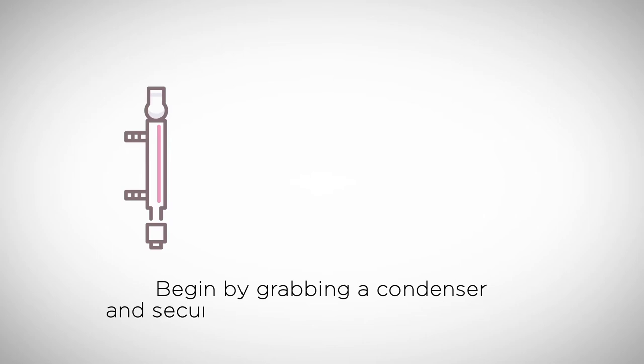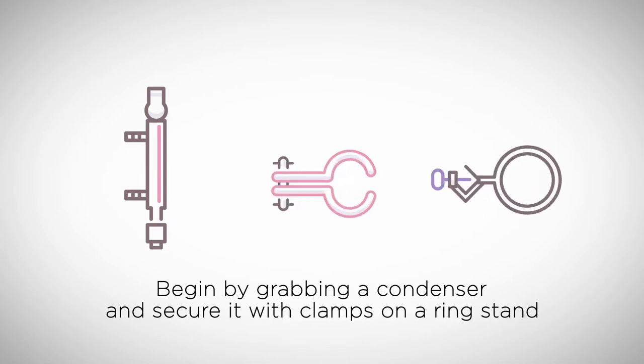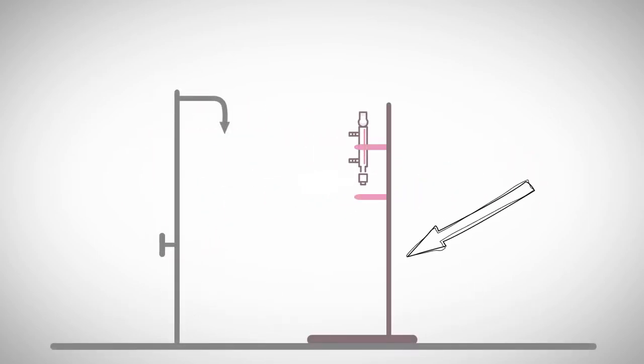Begin by grabbing a condenser and secure it with clamps on a ring stand. Make sure the clamps are high enough to allow space for jack and heating mantle underneath. This will allow for easy removal of heat source if needed.